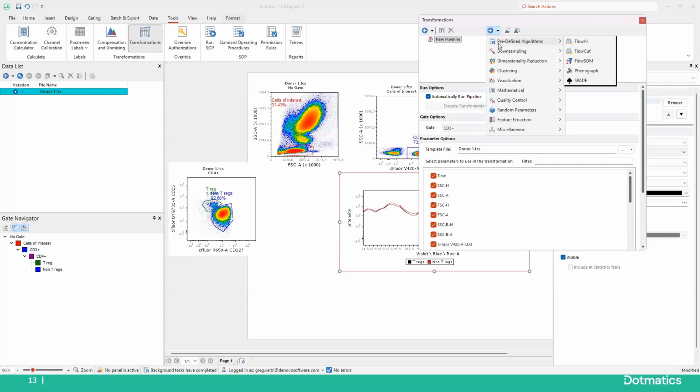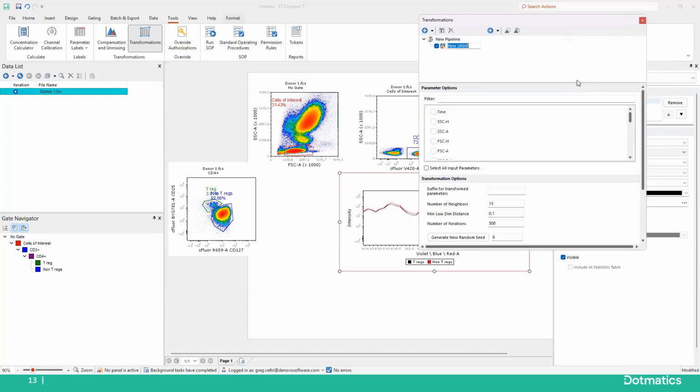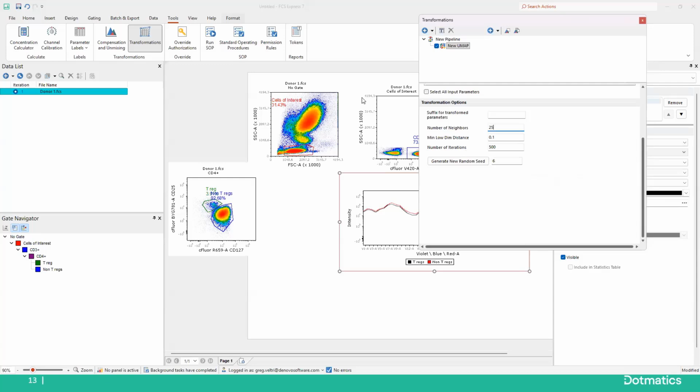Adriana, who asked that, sorry. What we have is in here. We have different downsamplings, and what I'm going to do is a UMAP today. I've done this before for this particular one, so I'm just changing this to make something a little simpler and quicker for us. So I did that, and then let's insert a plot.